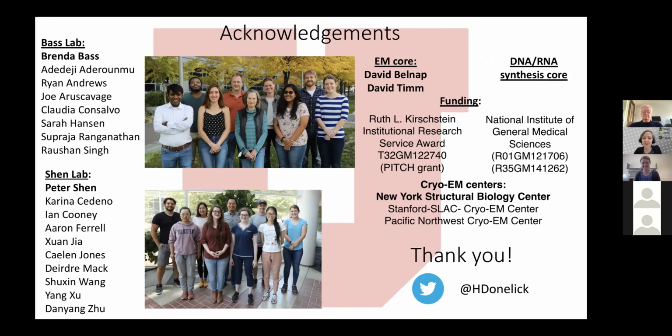So your co-expression in SF9 cells, do you infect with 2 different viruses, or do you put both genes in the same baculovirus? Yeah, that's a good question. For my Dicer2 and R2D2, I infect my cells with 2 separate viruses, but other members of my lab have actually now used a P-big vector, and they're able to combine multiple proteins within one, so they don't have to do the multiple viral expression. But I use 2 viruses.